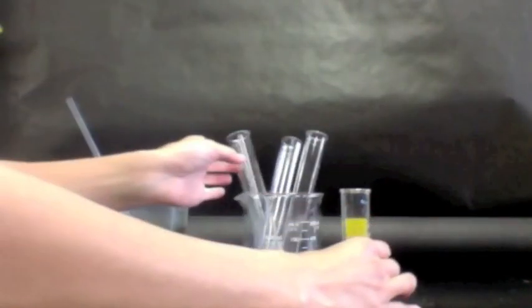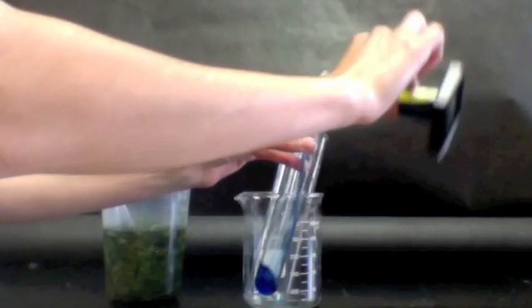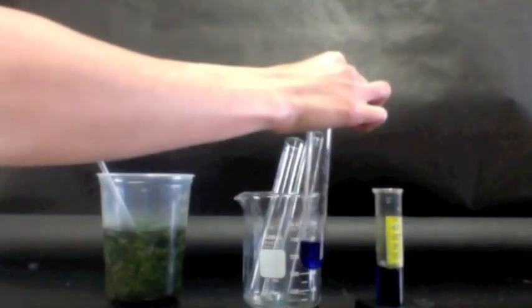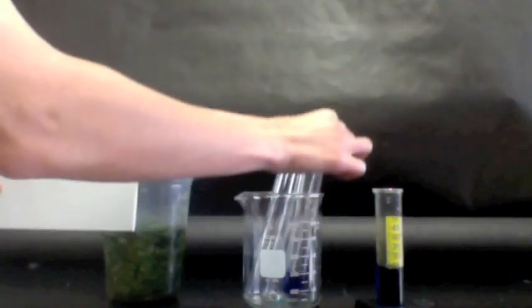The first thing we're going to do is just set up a control so that we can see what BTB looks like just by itself. There's a little bit in there. And we're going to just hold up something white behind it so that you can see the color. And that's going to serve as our control.